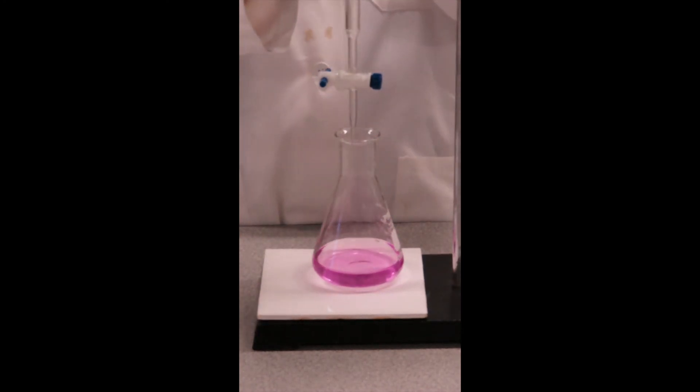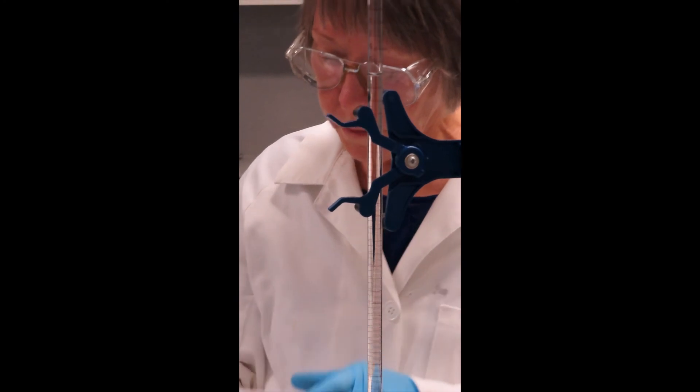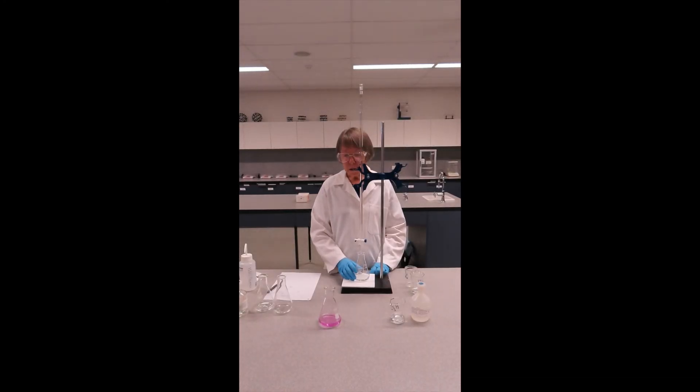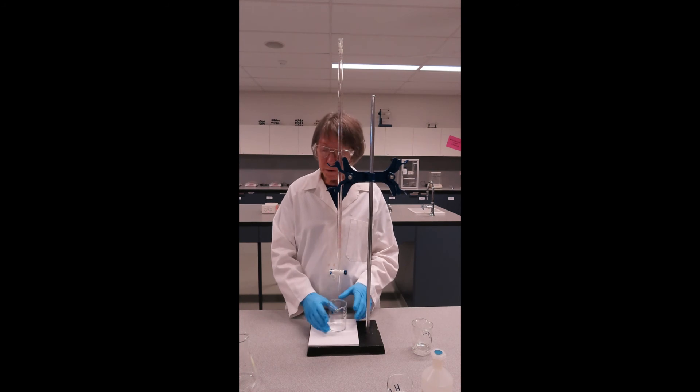Again, I take a reading. 23.21. So having done that first one gives me a pretty fair idea of where my end point should be. So in a second titration I can run the solution through much more quickly and stop when I'm close to the end point. Having done one titration I'm going to do a second.